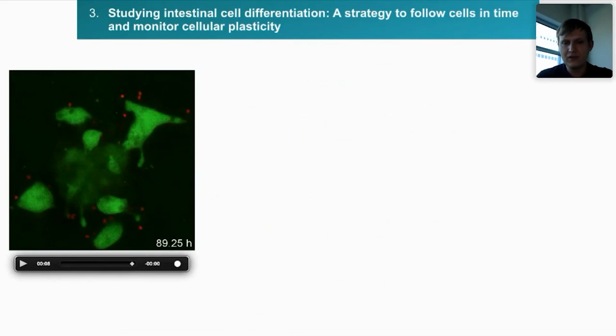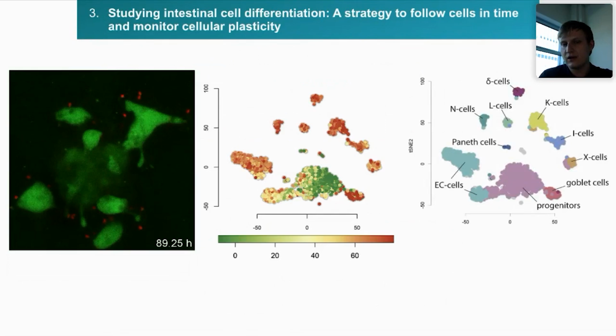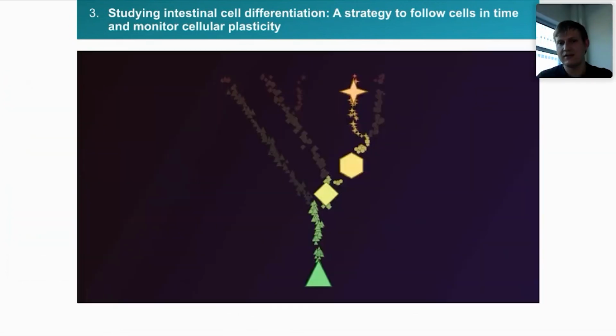This color change makes it possible to estimate the age of the cells and cluster them, sort them using a FACS, and after that it is possible to do single cell sequencing and learn a lot about these different terminally differentiated cell types with this extra information of time.